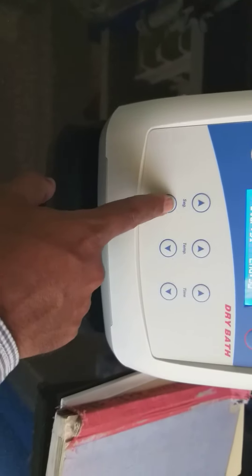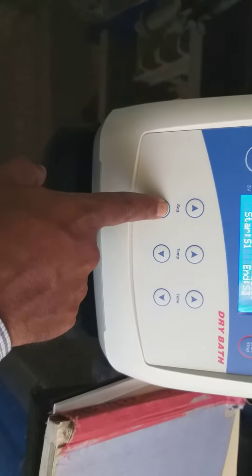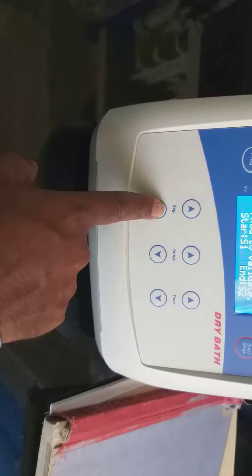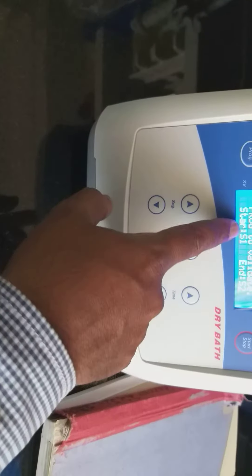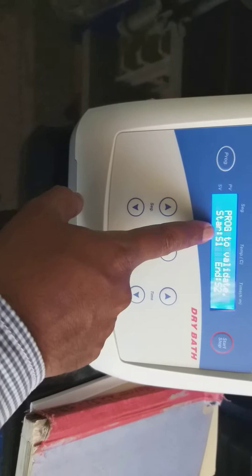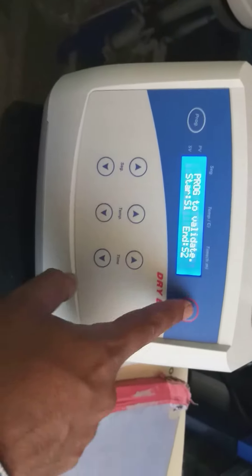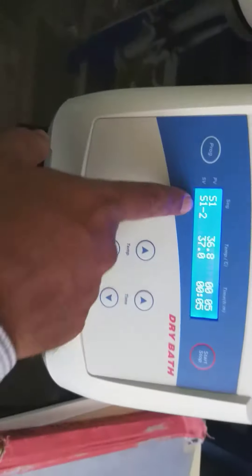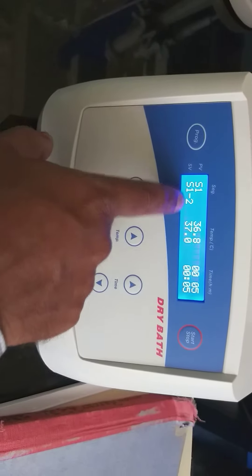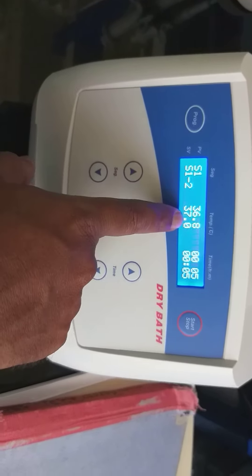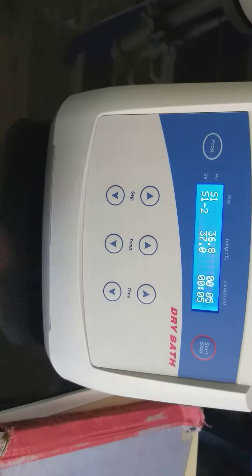Suppose if you want to run 1 to 2 programs: starting program S1, end program S2. Now you start. See — S1, S2 — where is the program?